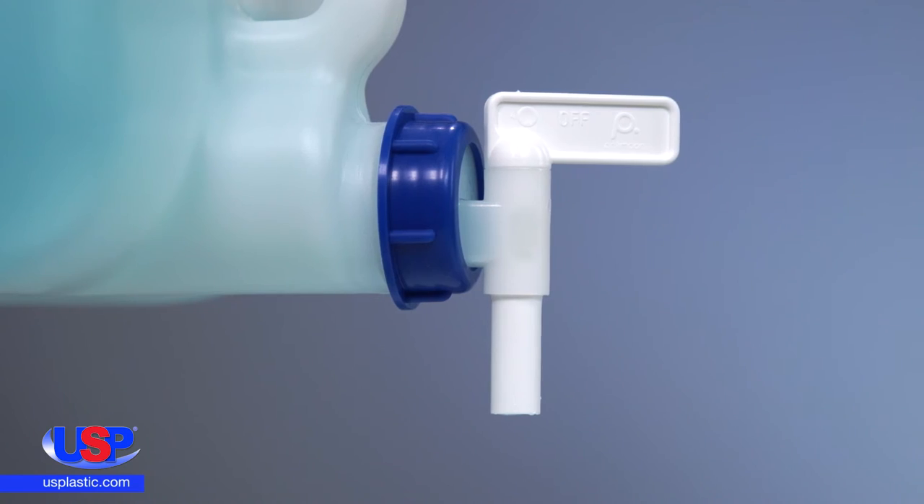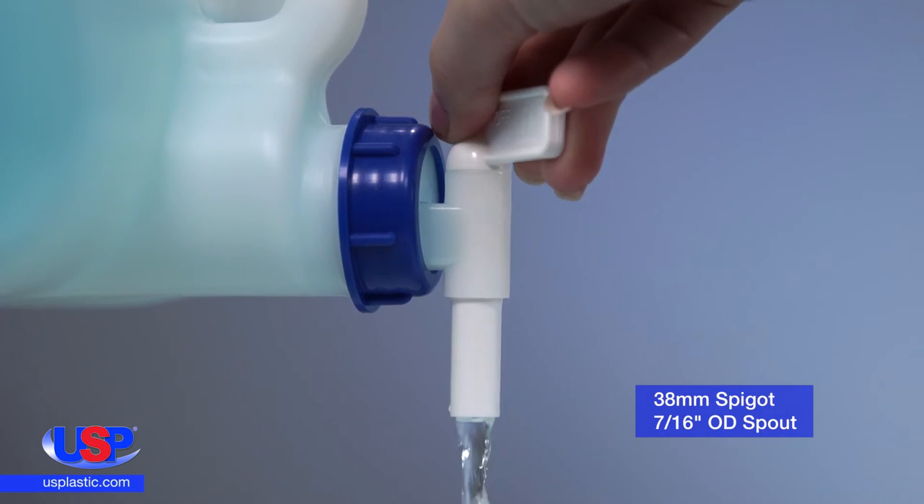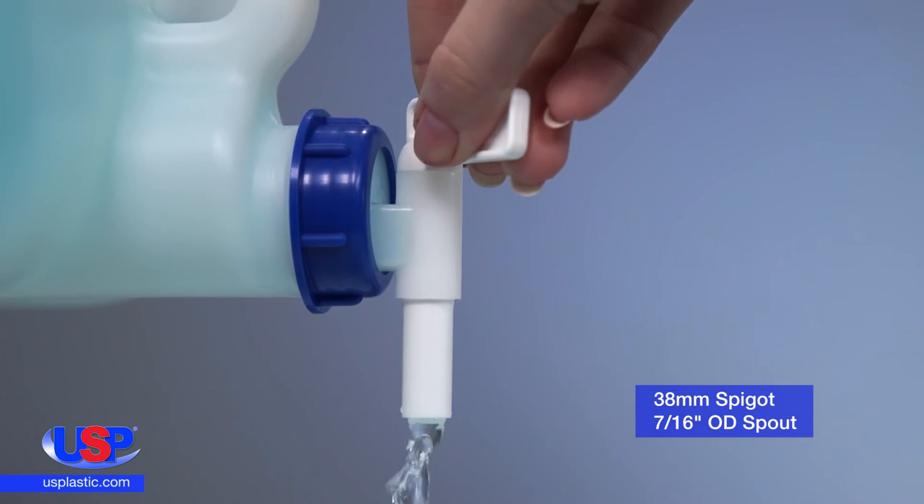This carboy is uniquely molded to ensure full drainage, and the 38mm opening provides ample room for liquids to flow freely to the spigot.